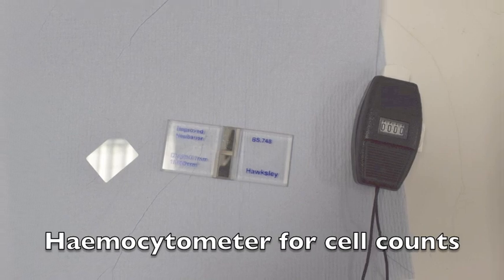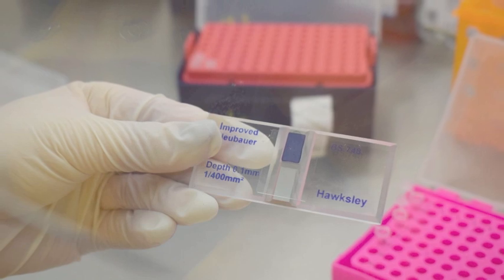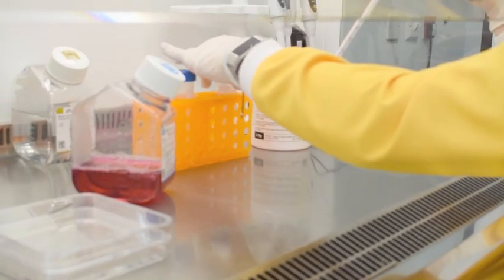Cells are then counted using a hemocytometer. Based on the cell count, the suspension is diluted to a density of 500,000 cells per ml.